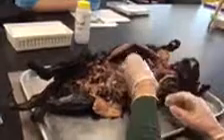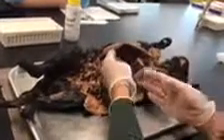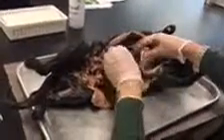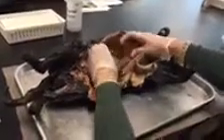from the right side. The diaphragm is going to be that large dome-shaped muscle that covers over top of the liver and is just inferior to the lungs. So when we move the diaphragm up out of the way, and if we lift the liver, we can see where the esophagus enters into the stomach.